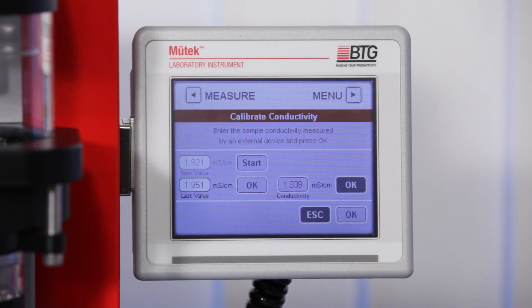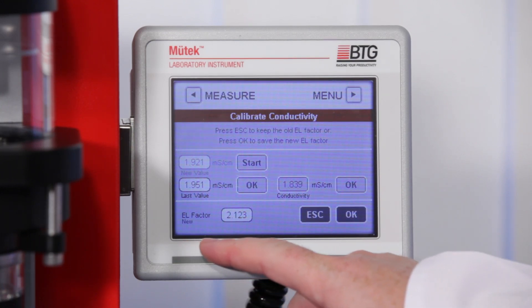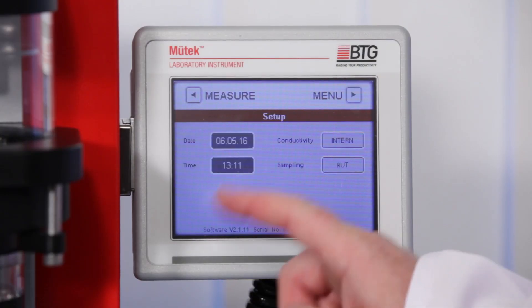Press OK to display the newly calculated EL factor. Let's have a look at the setup menu. Besides adjusting date and time, you can here select automatic or manual measurement.